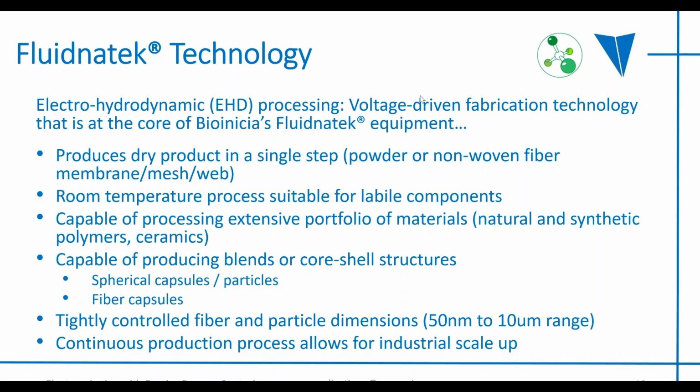Importantly, it's a room temperature process, which means that we can process materials which are particularly sensitive to thermal degradation or oxidation, and even living cells. It's a process that can be used for a very wide range of materials, which means that it's got a huge range of possible applications. And the materials can be natural polymers or proteins, synthetic polymers, ceramics, carbon, all sorts of things.